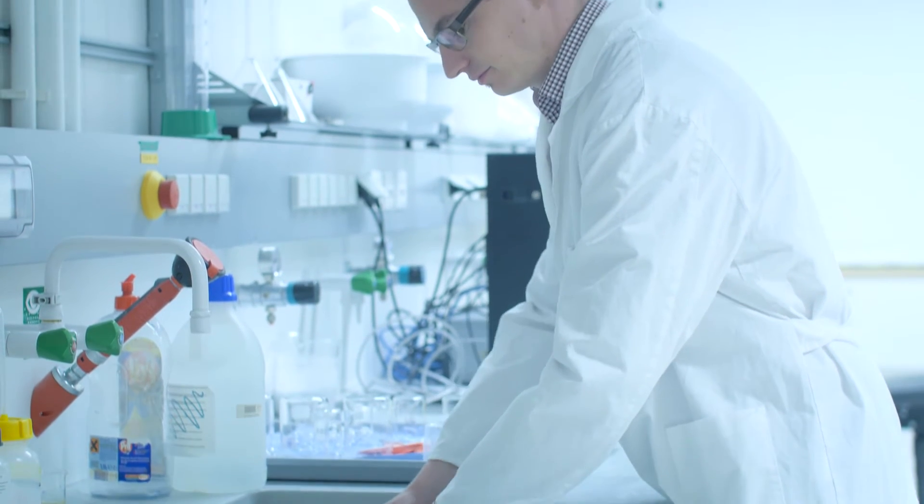Pharmaceutical polymers are typically hygroscopic and simply not well suited for conventional preparations. I lost valuable time in the lab cleaning my equipment and couldn't concentrate on more important tasks.